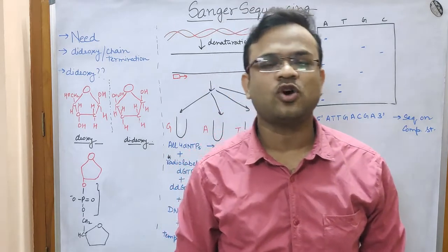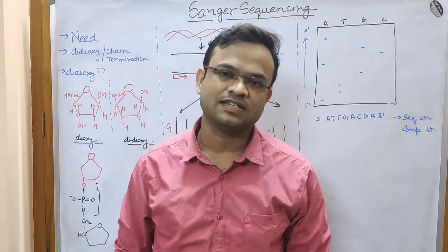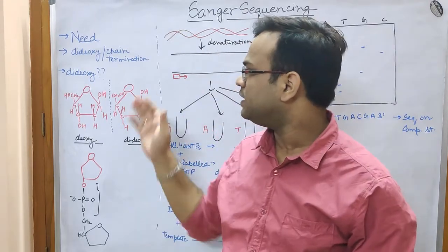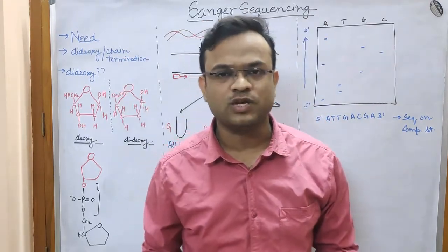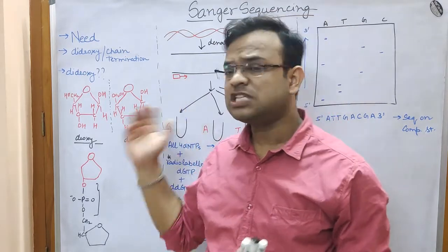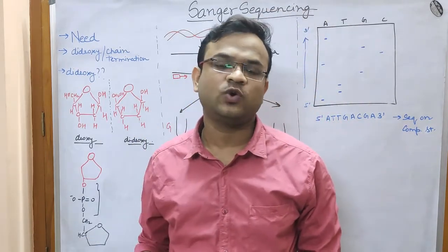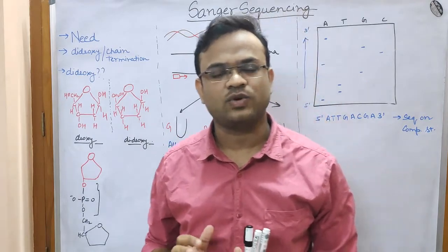The topic that we would be dealing with today is Sanger sequencing. This is a very important topic and is asked in multiple life science examinations. So, in Sanger sequencing, we would be dealing with what is the need of Sanger sequencing, what is the principle of Sanger sequencing, and also how do we read a sequence with the help of Sanger sequencing, right?